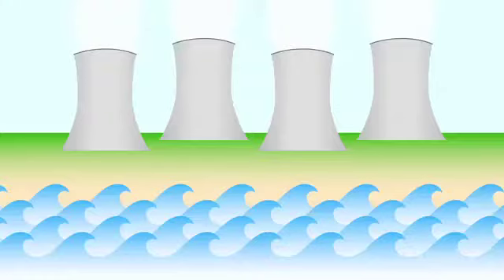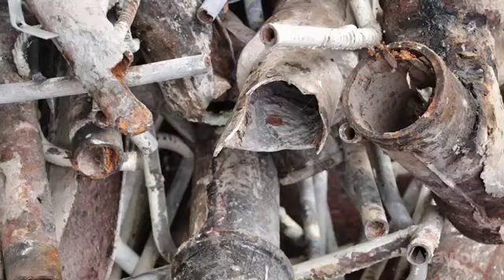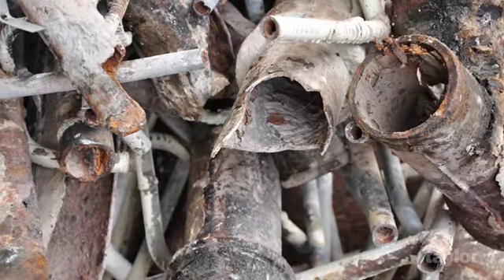Chloride is also prevalent in seawater, which is used by many industries to fulfill their cooling water needs. All cooling waters have a recommended maximum chloride level. If concentrations become too high, corrosion of metal pipes and related equipment may occur, resulting in shutdowns for repairs or costly equipment replacement.